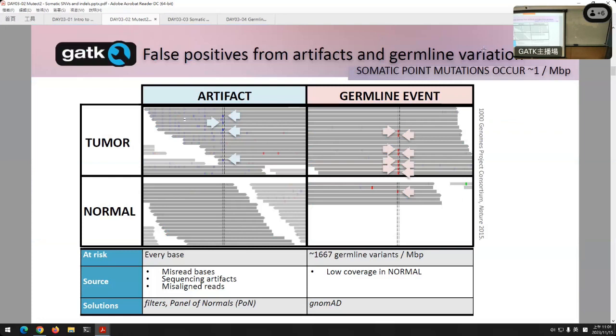There are still areas that are hard to align to. There are still going to be artifacts that we have in reading. Some even worse. But the thing is, there are also other classes of issues, because on the right, you start looking at something unique to this problem space compared to germline calling.